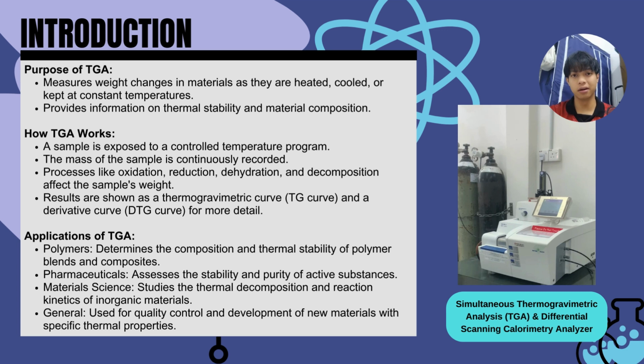Thermogravimetric analysis is a crucial technique for understanding the thermal behavior of materials. Its ability to measure weight change under controlled temperature conditions makes it indispensable for various industry and research applications.